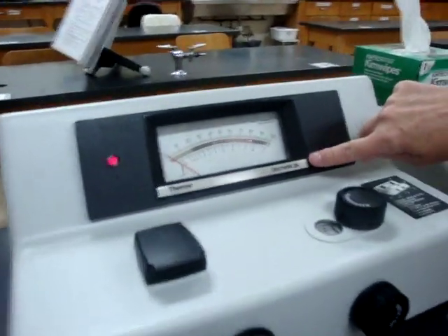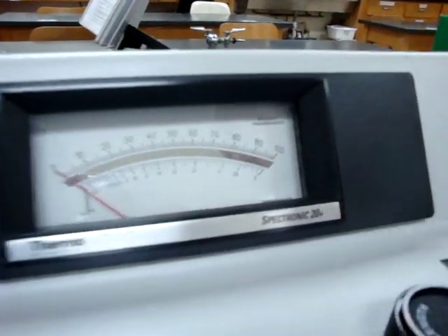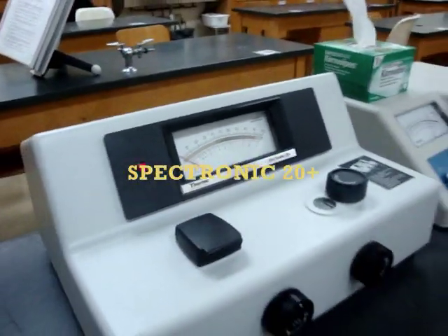Today we're going to talk about the operation of the spectrophotometers you'll be using in your labs. We have two different types: the Spectromaster and the Spectronic 20 Plus. Each one operates a little differently. The first thing we do is turn on both machines and let them sit for at least 20 minutes to warm up.